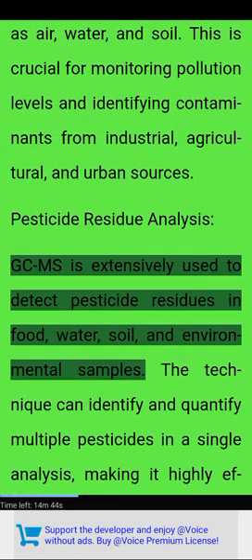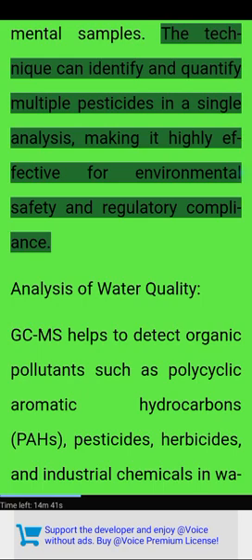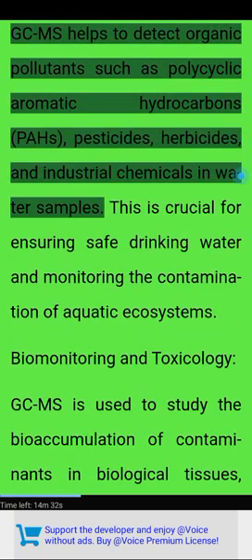Pesticide residue analysis. GCMS is extensively used to detect pesticide residues in food, water, soil, and environmental samples. The technique can identify and quantify multiple pesticides in a single analysis, making it highly effective for environmental safety and regulatory compliance.